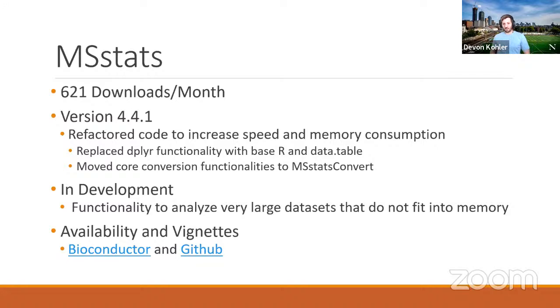Currently, we're developing some new functionality to analyze very large data sets that don't fit into memory. We've been running into some experiments with 50 gigabyte plus data files that basically you can't load into R. So Mathias has been working on functionality where you don't have to load it all into memory and then process it, so that we can handle those big data files and do analysis on them. That should be coming along shortly.